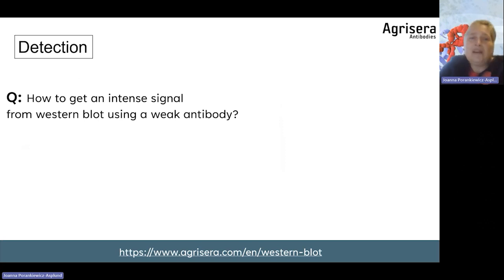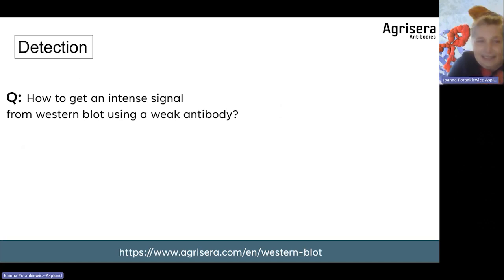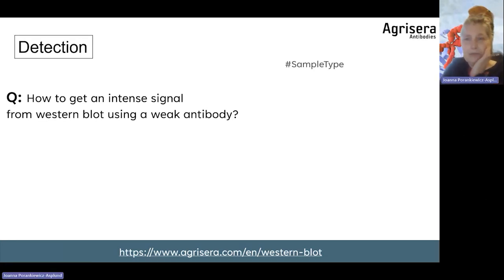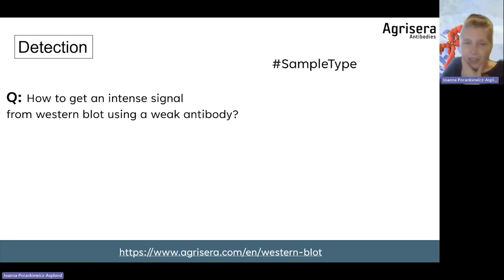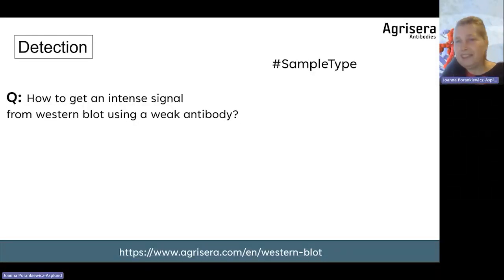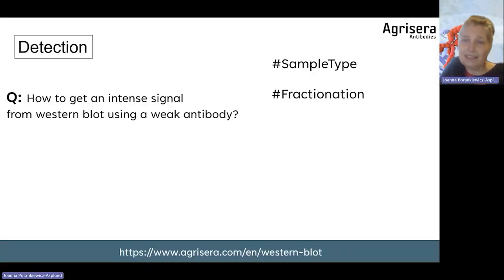Now we are coming to how to get an intense signal from Western blot using a weak antibody. Before you deem an antibody to be weak, you should go back to the desk and do a theoretical analysis.